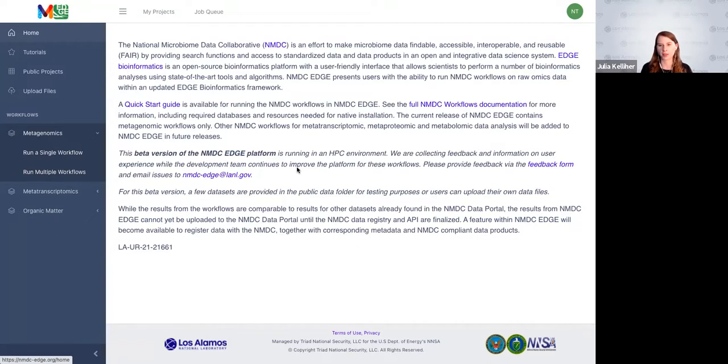Plus the admins, if we go in to kill a job or something like that. So the shared option is for individual users that you want to share your project with. Publishing to make it public means all users can see that. And the job queue button, anyone can see anything that's running. It's a great question.